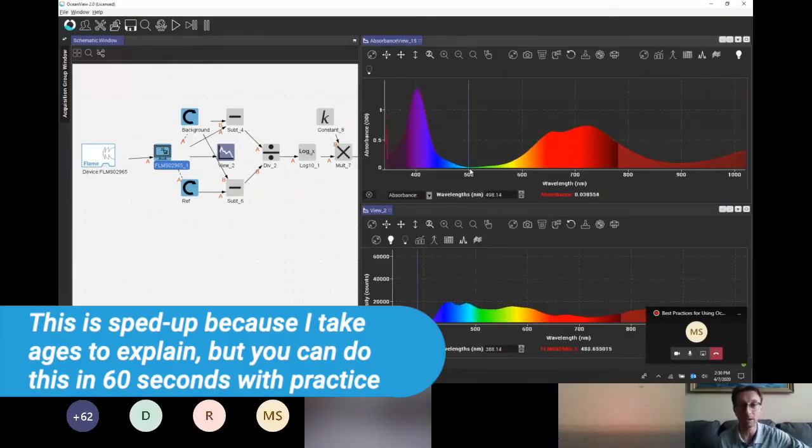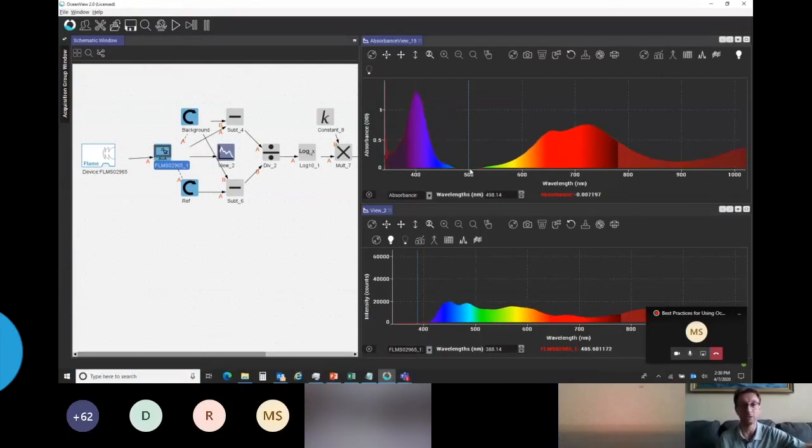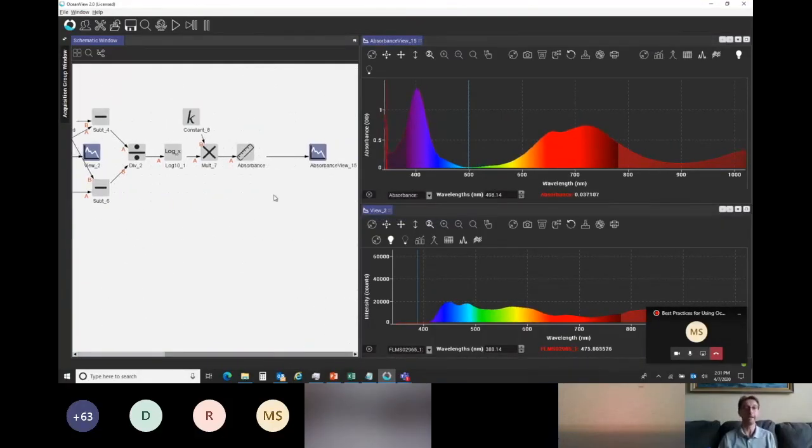Notice, if I can, I'm going to move the cuvette around a little bit. Well, I can't really see it too much. Oh, there you go. See how by moving the cuvette, I can move that around a bit? We don't want that to happen. So let's go ahead and take a subrange and peg that to 0.